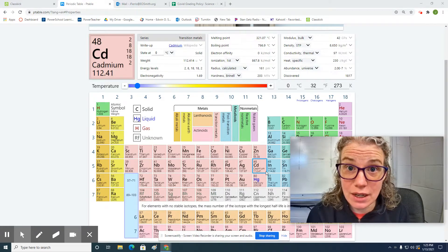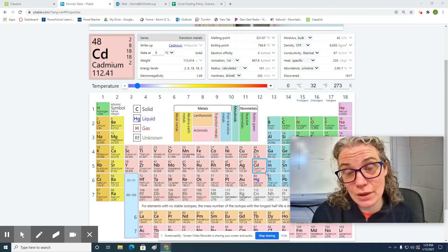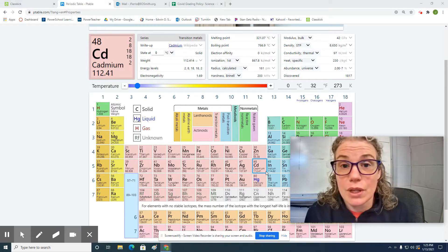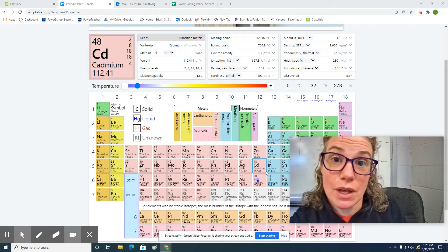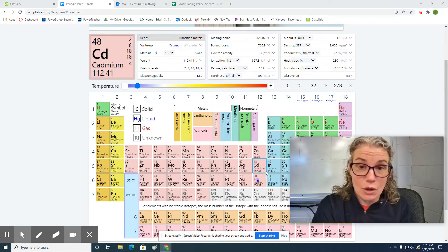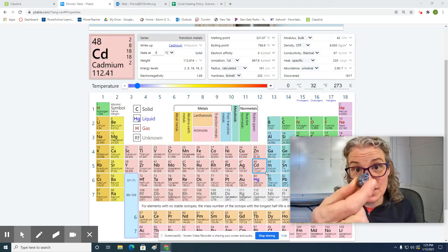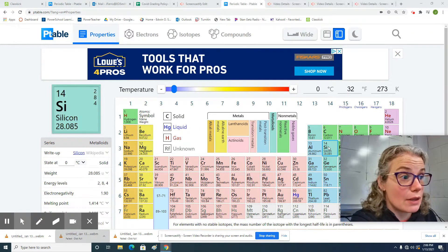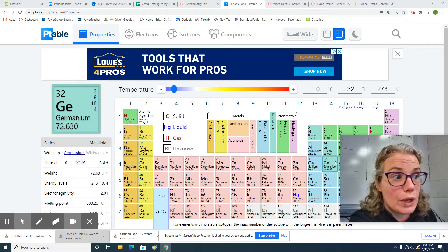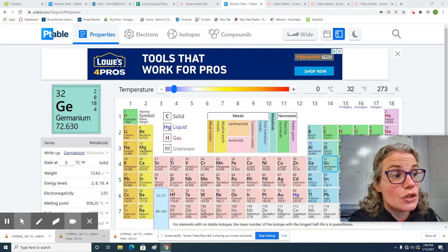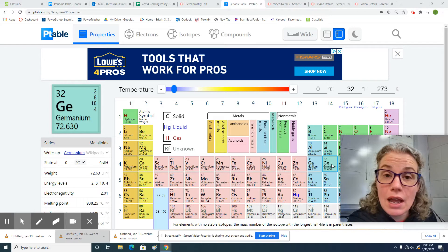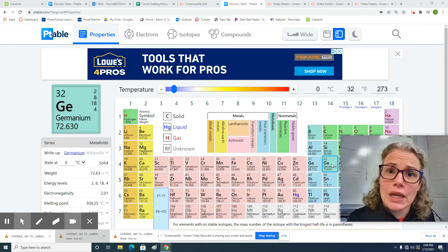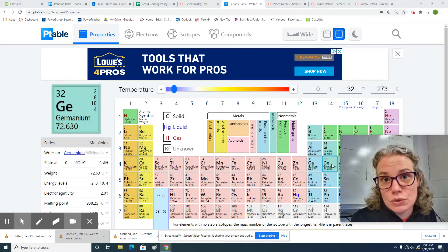We're going to see if there is a pattern for density on the periodic table, and if there is a pattern, can it be used to determine the density of an element that we don't know the density of. The three elements we're going to be testing today — lead, tin, and silicon — are all within the same group on the periodic table. We're going to use a graph to predict the density of germanium, then look up the actual density to see how close we came.